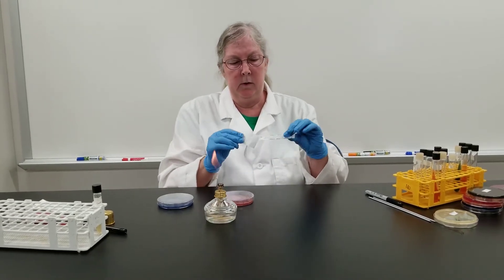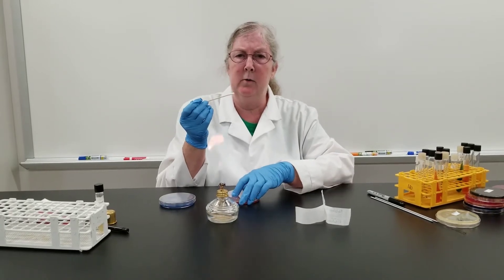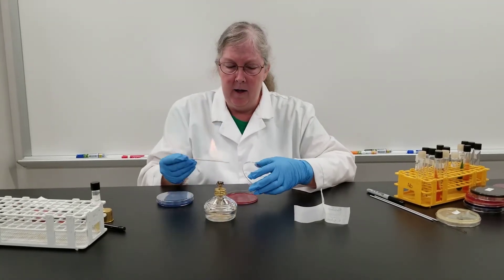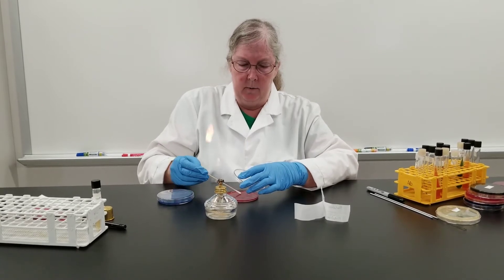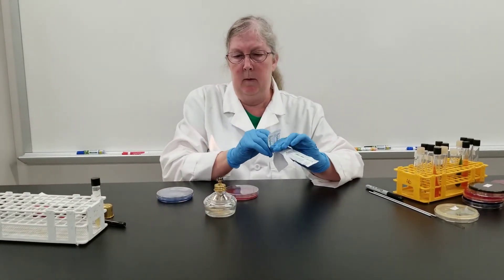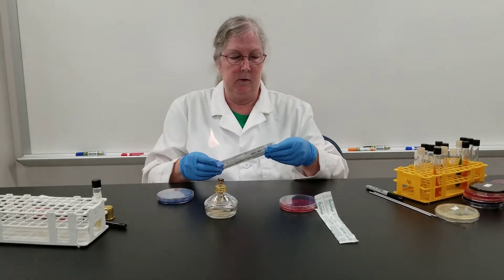So I'm using a sterile cotton-tipped applicator to do a back throat swab, and then swab this on the blood agar plate. Always working within the flame for maintaining the sterile technique.